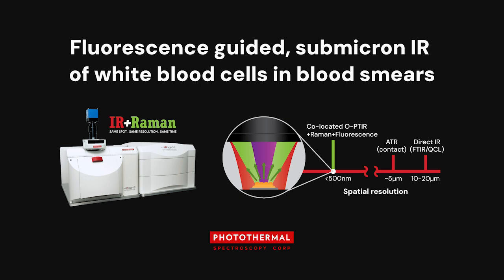Oh, great. In fact, that was a great question, because I think it clearly demonstrates that there are certain cell types and certain tissue types as well that are very fluorescent, even with 785, as you just said. And that's where I think O-PTIR really does make a difference, with its zero fluorescence background.